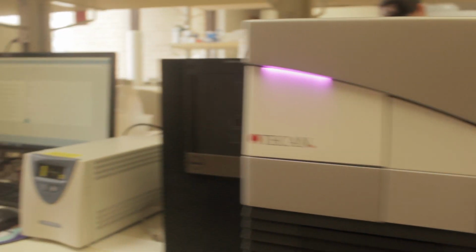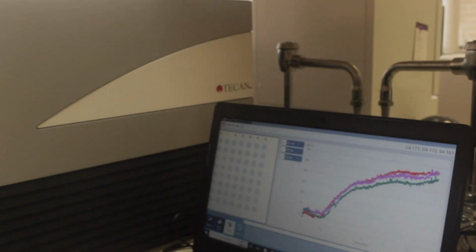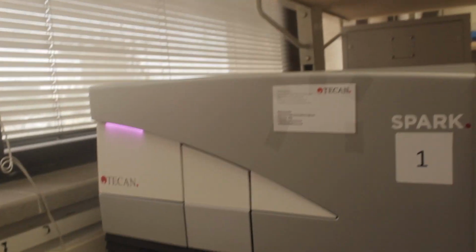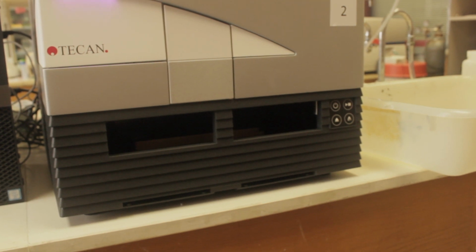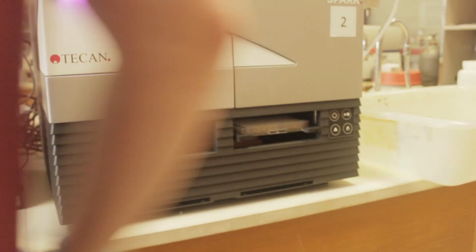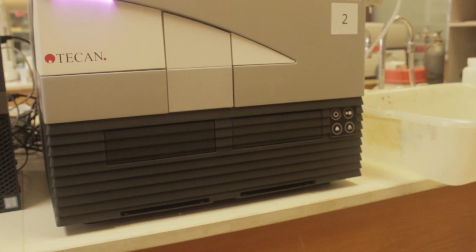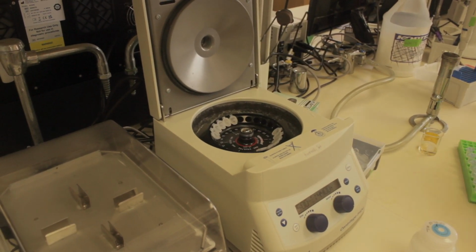These instruments enable precise control of incubation, agitation, and continuous monitoring of fluorescent probes used to detect amyloid fibrils at minute intervals. This cutting-edge approach allows us to discern subtle changes occurring at each stage of aggregation, offering valuable insights into how different fatty acids and lipid vesicles influence the aggregation kinetics. Our findings pave the way for understanding the intricate mechanisms underlying protein aggregation and its modulation by various lipid species.